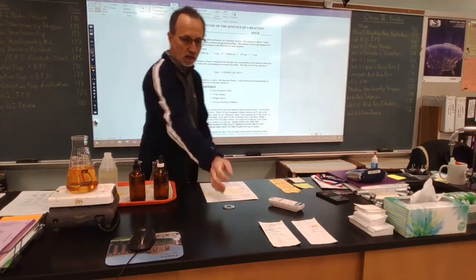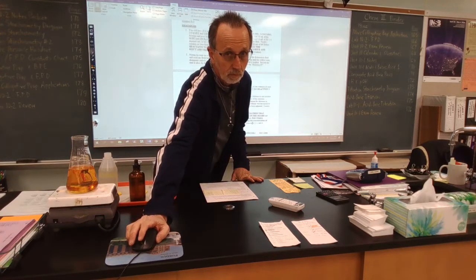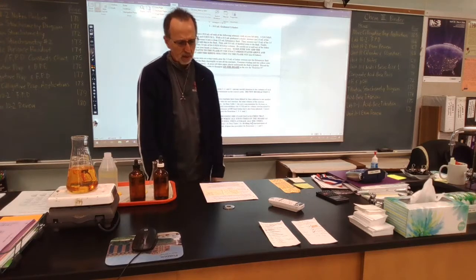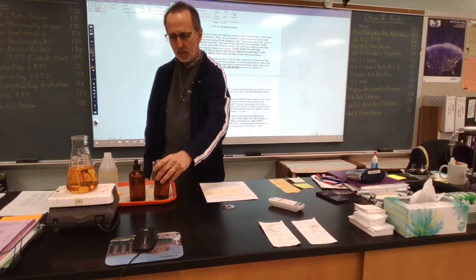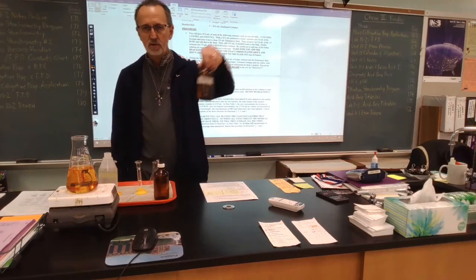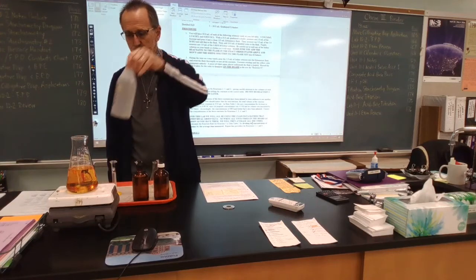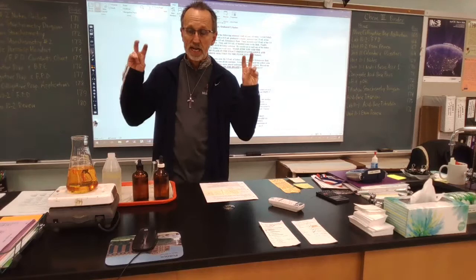Let's go through quickly before we do the preliminary work. So we have right here hydrochloric acid. We have water, which is going to act as our volume equalizer.